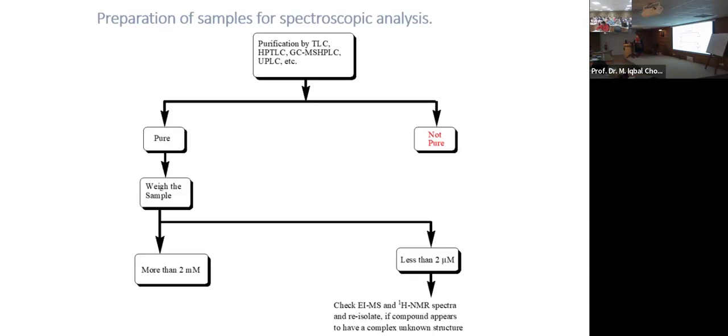But the large molecule starts from, I would say, around 900 daltons, as a small, medium size, very small peptide.